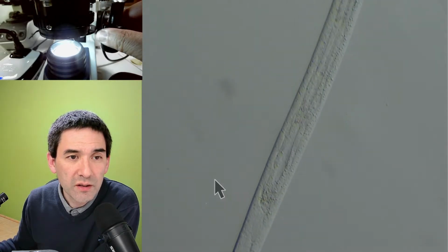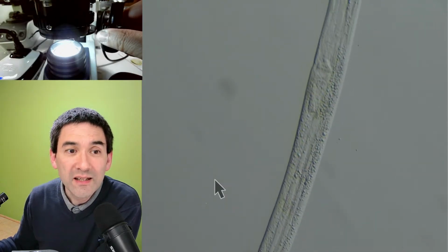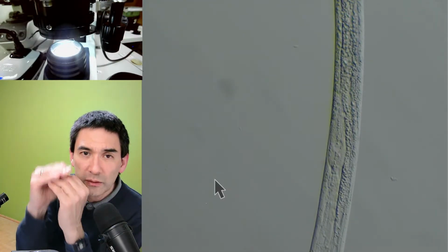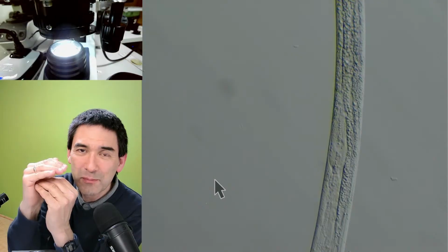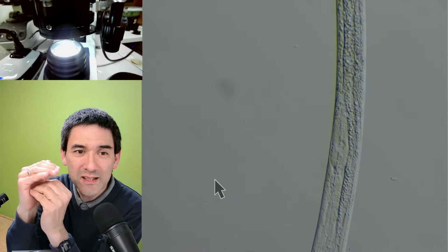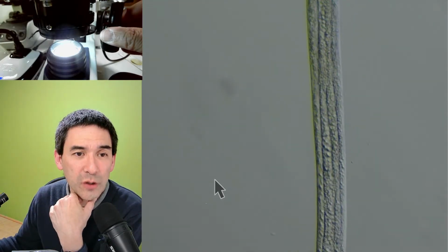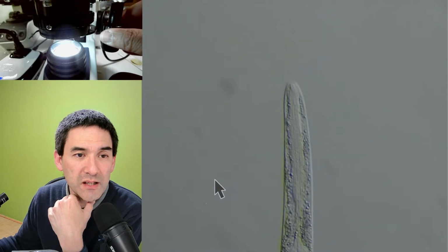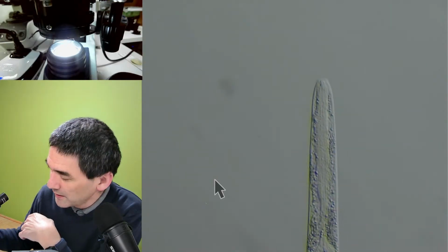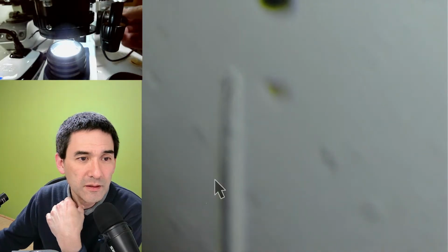Yeah, looks the oblique effect, surprisingly slow for a nematode. It is slow because I limited its movement. There's so little liquid that it's squeezed between the cover glass and microscope slide. That's the reason why it's so slow. It's physically limited in its movement. Maybe if I find a smaller one somewhere, then let's see.